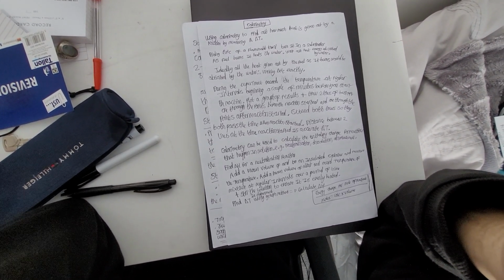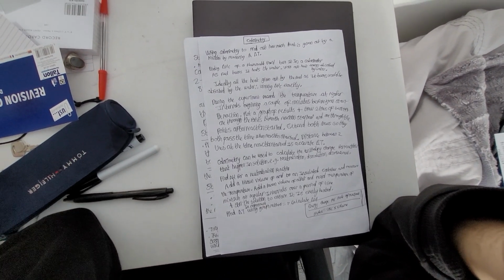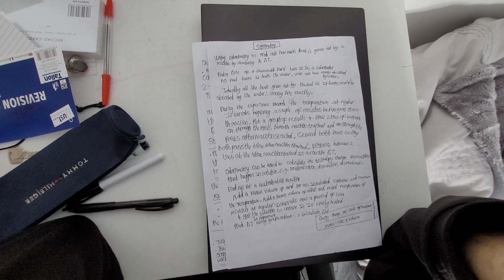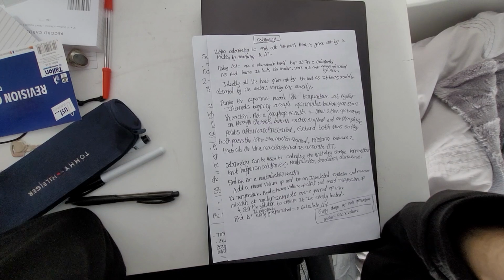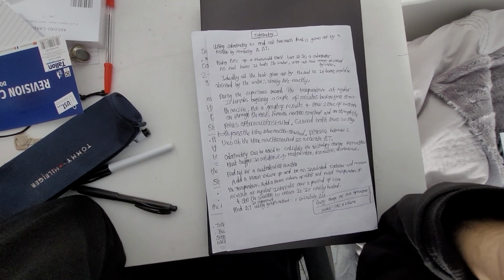Finding the enthalpy of combustion of a flammable liquid, where we first burn in a calorimeter. As the fuel burns, it heats the water, then we can work out the heat energy absorbed by the water. Ideally, all the heat given out by the fuel as it burns would be absorbed by the water, therefore working out delta enthalpy of combustion exactly. But that's not the case. We lose heat.